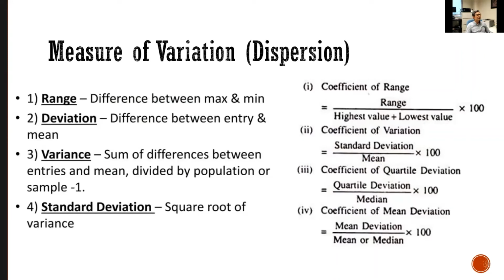so the statistical basis for this is we need to find a measure for the variation or variability to describe the dispersion of gene expression across cells. There are many different measures we can use: the variance, the standard deviation.